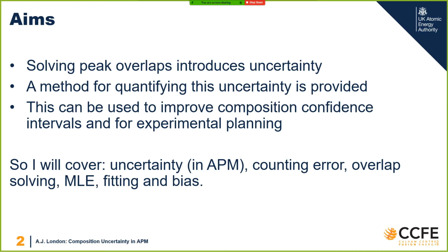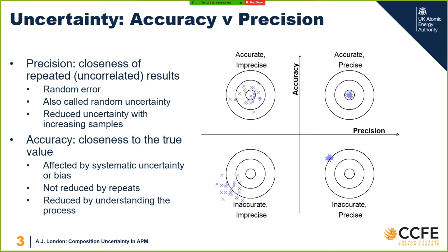So I have my own plotter, which I think looks quite nice, simulating mass spectra, and making peak overlap diagrams. If there's time, we can look at solving some peak overlaps, say from a line profile or maybe from clusters. And I'll give you a demo of that. That's the kind of main bulk of what I'll call a toolbox, even though it's not packaged as one.